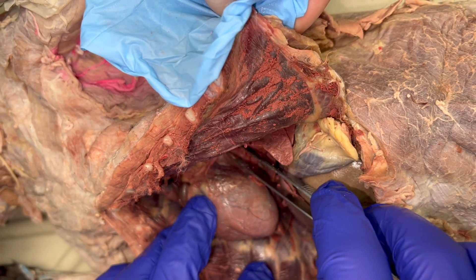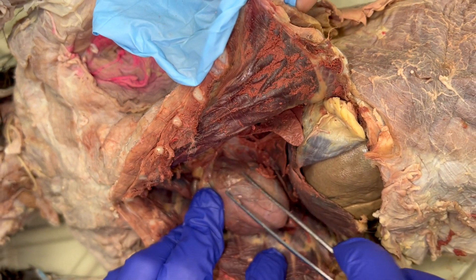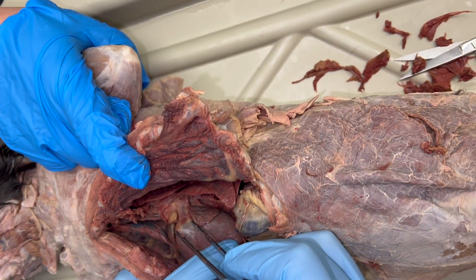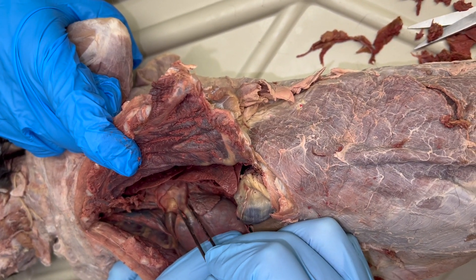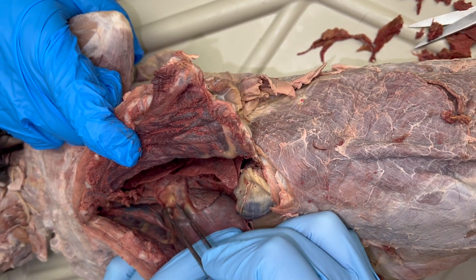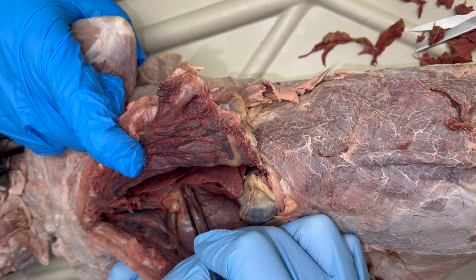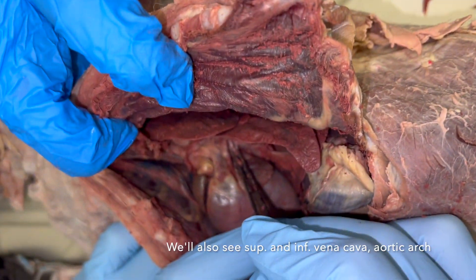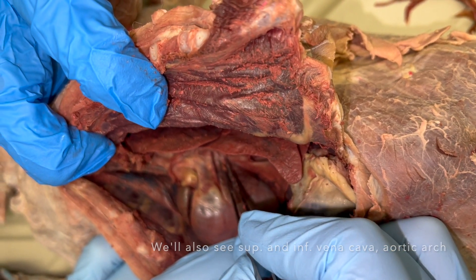Now that we're pushing the heart to the side, you can see the pulmonary trunk, and when you dissect it further along you'll be able to see it narrow into a pulmonary artery. Next to the auricle you can see the pulmonary vein — that's being squeezed right there.